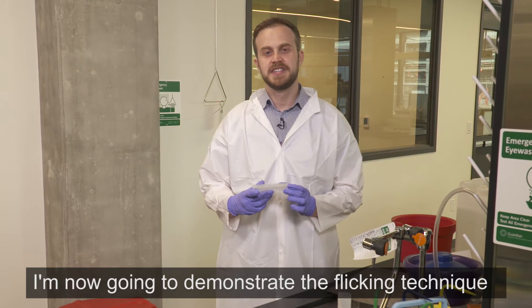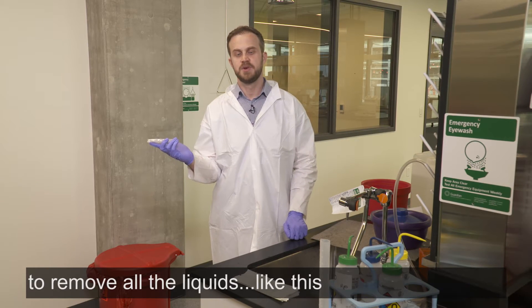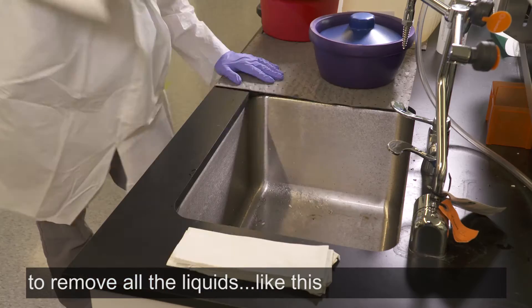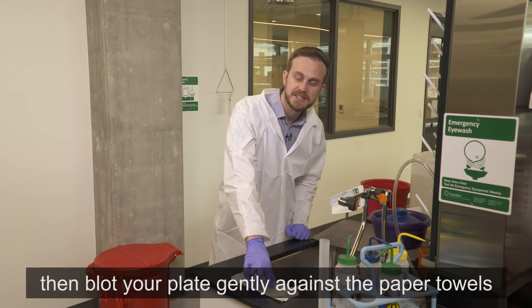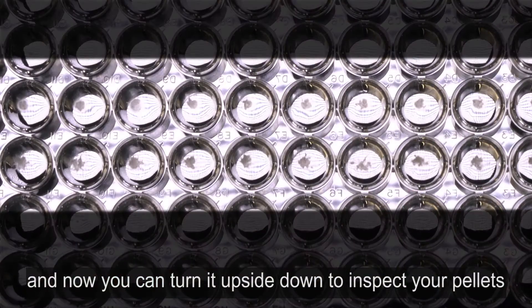I'm now going to demonstrate the flicking technique. The flicking at the end should be confident enough to remove all the liquid like this, and then blot your plate gently against a paper towel, and then you can turn it upside down to inspect your pellet.